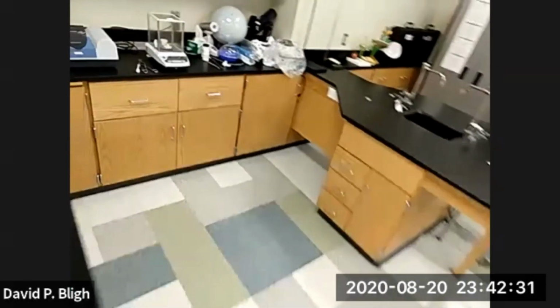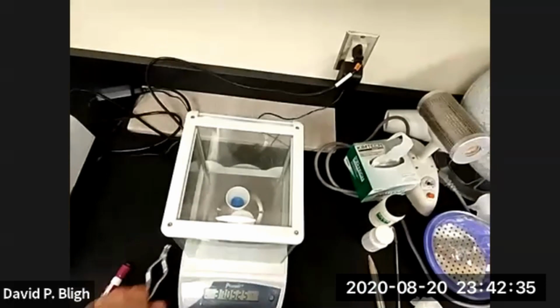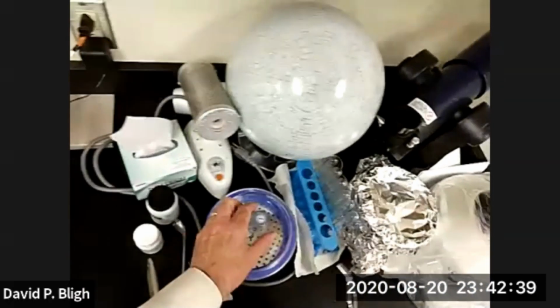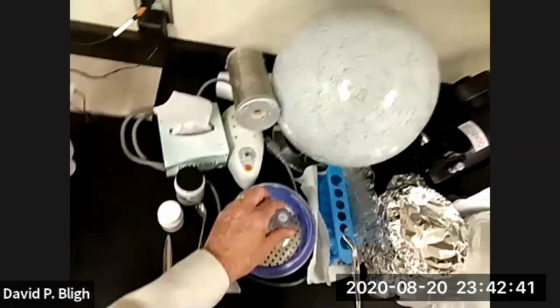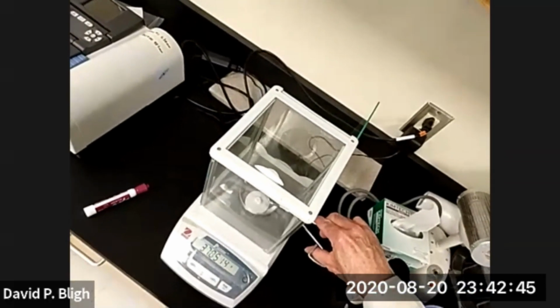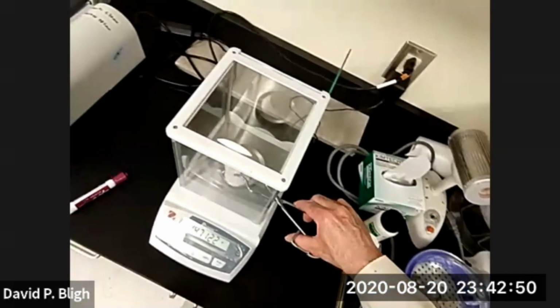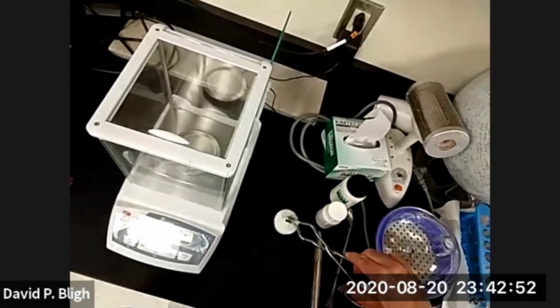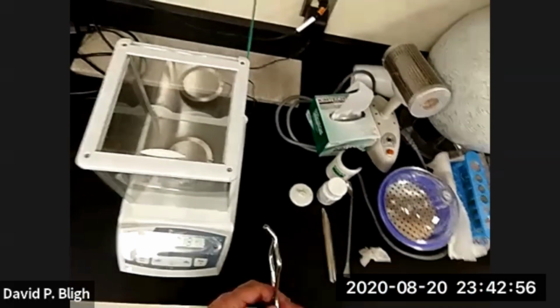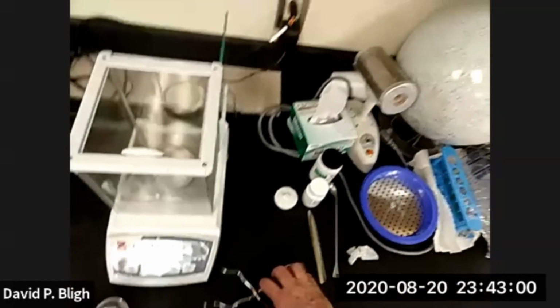Now, let's remove the crucible and its lid. Actually, now we don't need to put it in the desiccator because we're going to heat it up and drive off the water anyway. Right, so let's set this here. It might be safer to carry it in the desiccator. Let's do that.